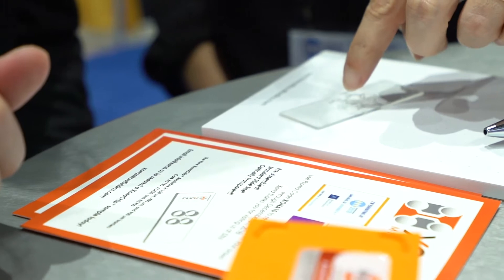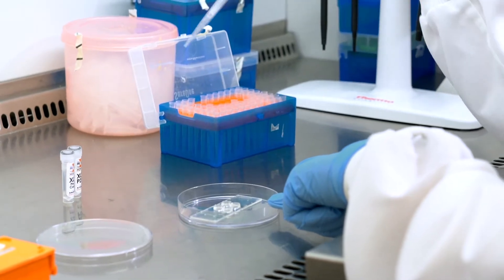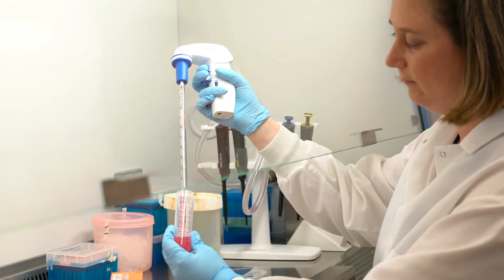Researchers have used these chips and other microfluidic devices to publish in high-profile publications such as Nature Communications, Nature Neuroscience, and different journals. We have over 700 publications where people have used our microfluidic devices or variants of them in their research.